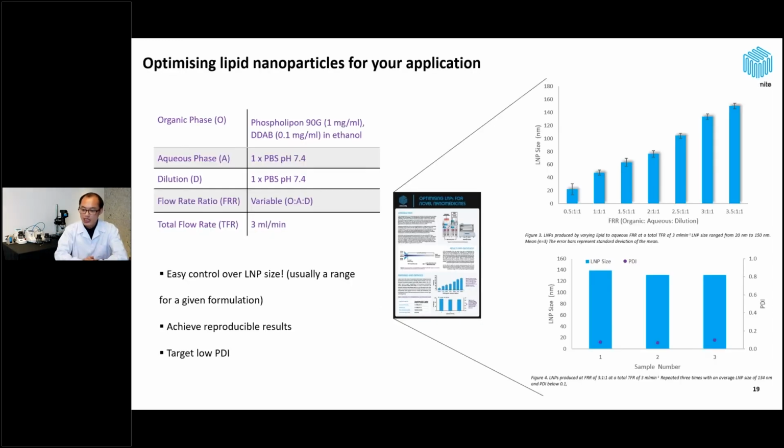So here is some experiment data that we have done in our lab using the ANP system to do the optimization of lipid nanoparticles for the application.